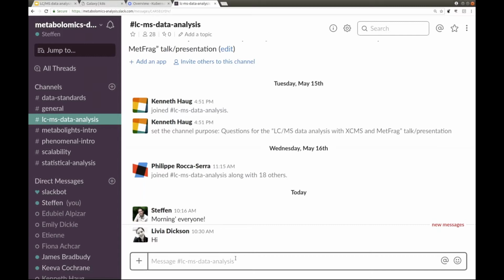So in auto MSMS, what the instrument is doing is acquiring a single MS1 scan, and then it's looking at the highest peaks in that MS1 scan, and then it's firing 1, 2, or 3 up to 10 data-dependent MSMS spectra that are targeting, so to speak, the loudest precursors found in the MS1 scan. And that way the whole LCMS run proceeds. So inside the LCMS file, you have both the MS1 and the MSMS information.